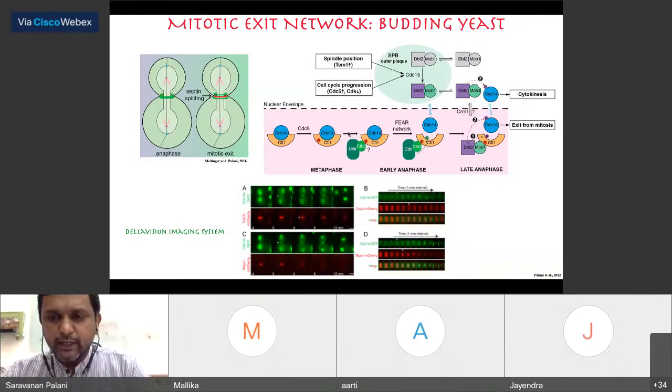So just to give one example, early in my PhD, I was working with the signaling aspect of cytokinesis, and one of the phosphatases, roughly 10 years ago. It's called CDC14. It's a conserved phosphatase from yeast to mammals. Most of the time it is kept in the nucleolus, as you can see, such a bright signal at the bottom, and then during late anaphase it comes out of the nucleus. There's no problem. People had seen this enough until then.